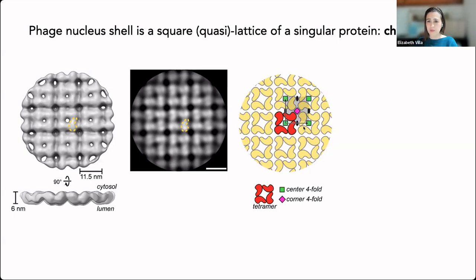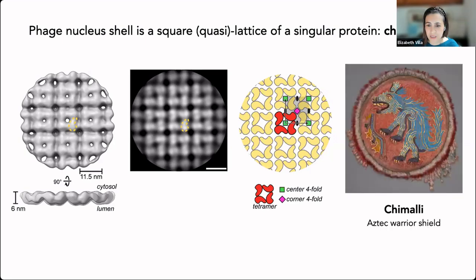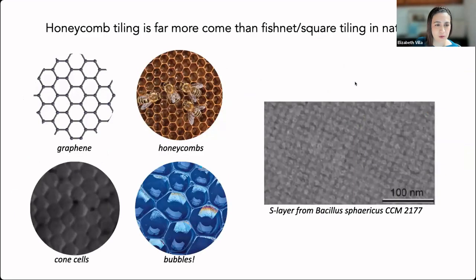And so at this point, we decided that we should name the protein. This protein I told you was called GP105, but in the different phage, that protein will be GP53. And I'll just show you a little bit more about genomes in a second. So we decided to call the protein, and my friend Kevin Corbett, who I'll talk about today, decided that there's probably enough Greek and Latin names out there. So we called it Chimalin after the Chimalli, which is an Aztec shield that warriors would bring into battle. So since this whole compartment is shielding the genome, we call it Chimalin. So I'll call it this from now on.